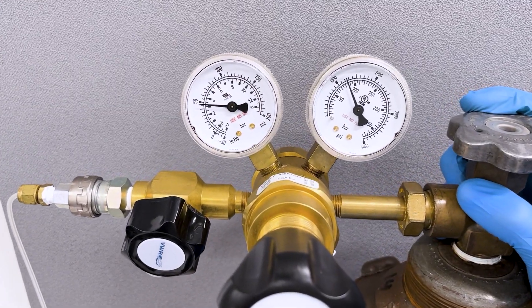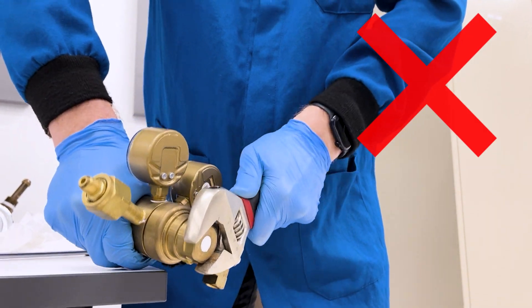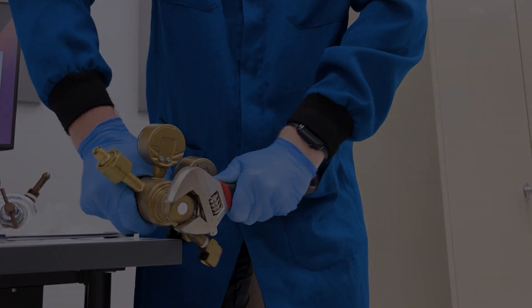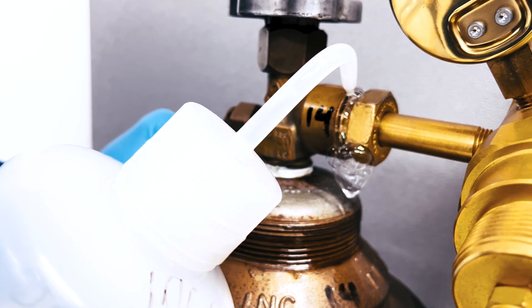Users shall never attempt to open, repair, or modify regulators. Regulators should be sent to a professional vendor for repair or servicing. In our next two videos, learn how to attach, remove, and leak test a regulator.